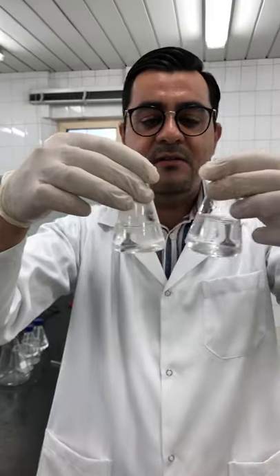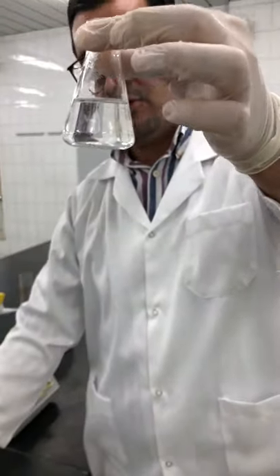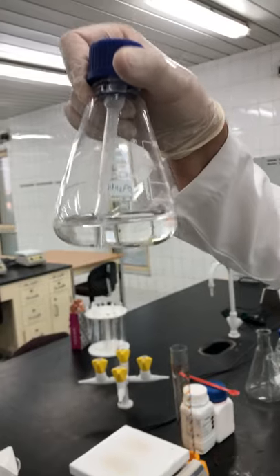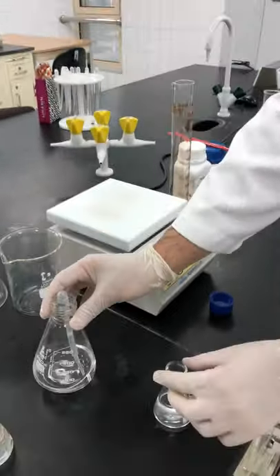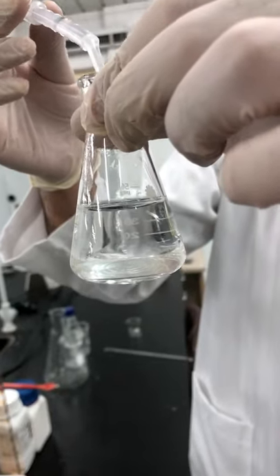Now let's apply the scheme I explained during the theoretical part. I'll take portion number one. According to the scheme, we have to add one milliliter of sodium phosphate to it. I'll take about one milliliter and add it in one shot, then we'll see what happens.